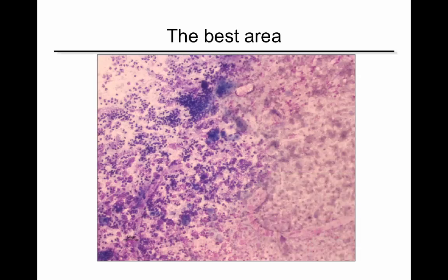So this is an example of a tracheal wash stained with Diff-quik. Which of these is the best area? I'm going to tell you right now, this is the best area because here I can actually see that the cells are well spread, and that's a neutrophil because I can tell by its segments. Here's mucus. This is really thick. I'm not going to see diddly in there, right? I will look in there, but I'm not going to spend a lot of time looking for bacteria in there because I don't even know what the cells are, let alone looking inside of them.